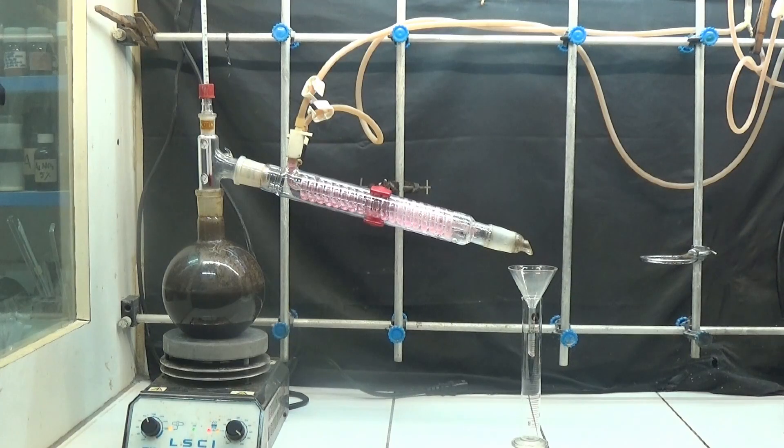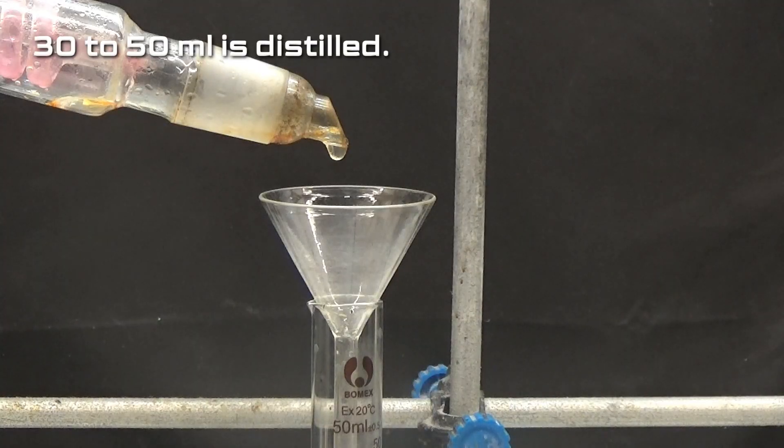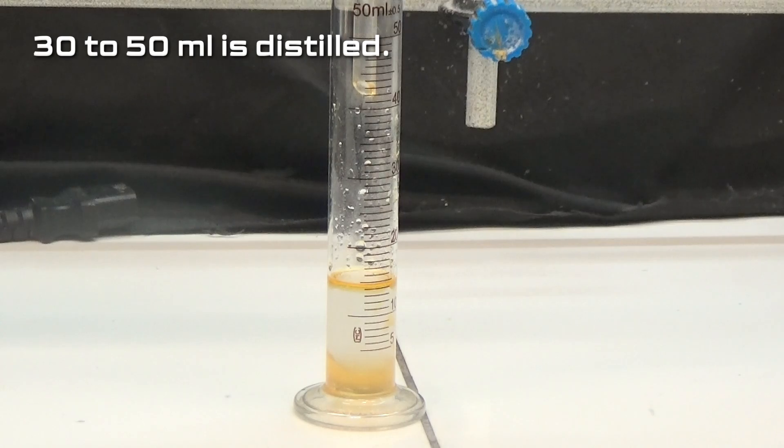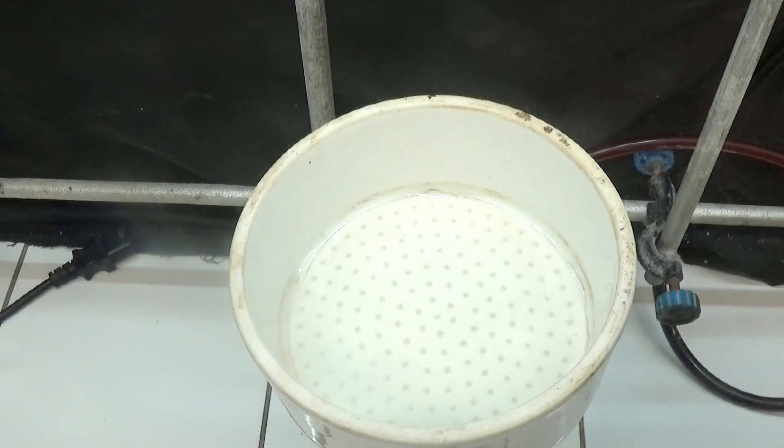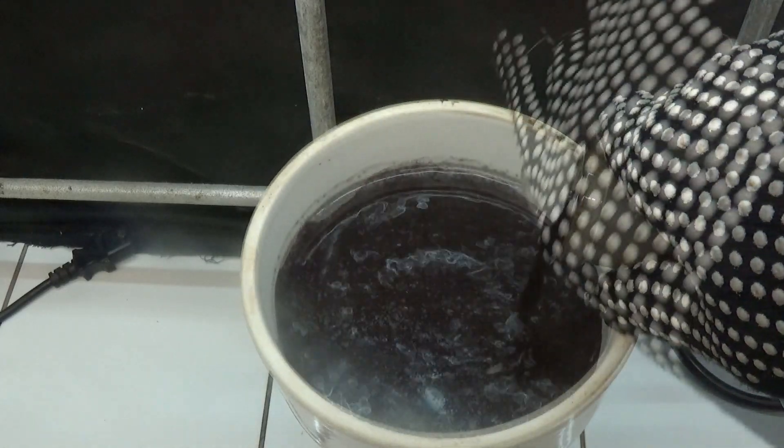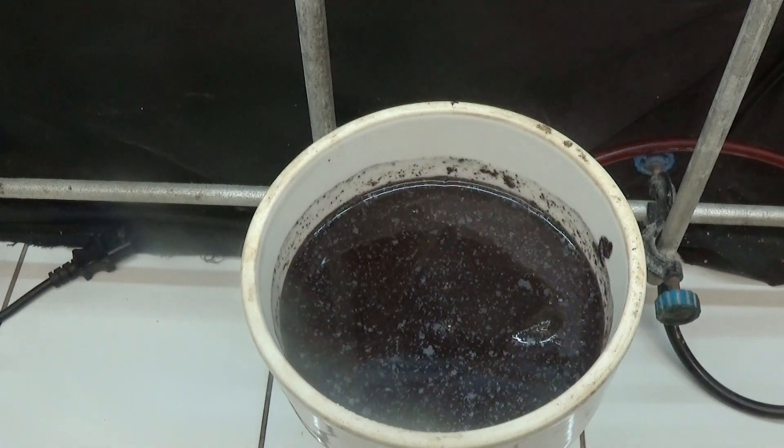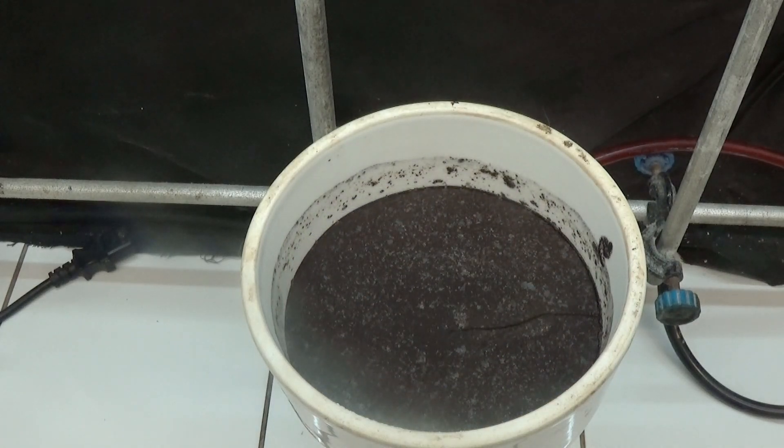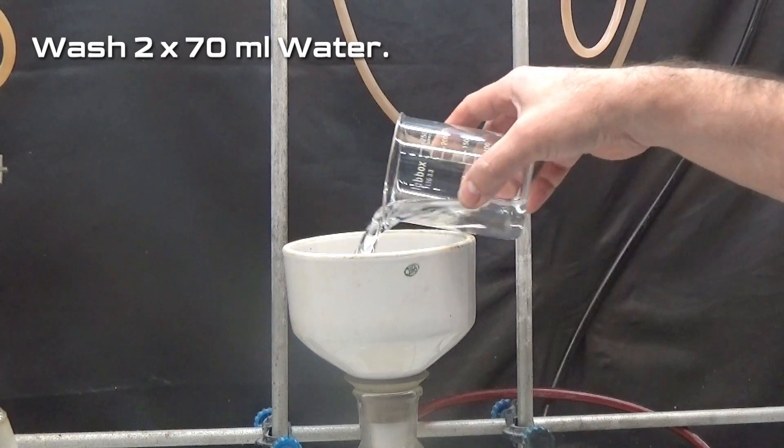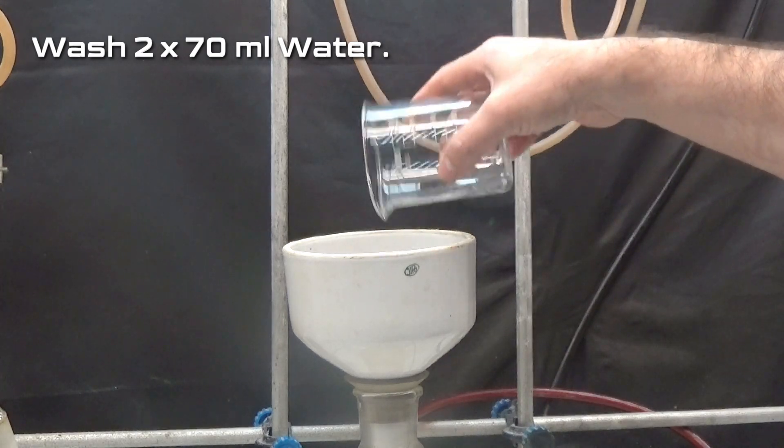After this reflux time a distillation apparatus is set up and a volume of 30 to 50 milliliters is distilled. This is done to remove the unreacted chlorotoluene. The distillate is discarded. Filter the still warm contents of the 1000 milliliters flask through a Buchner funnel with filter paper. Wash the solid twice with 70 milliliters of water.